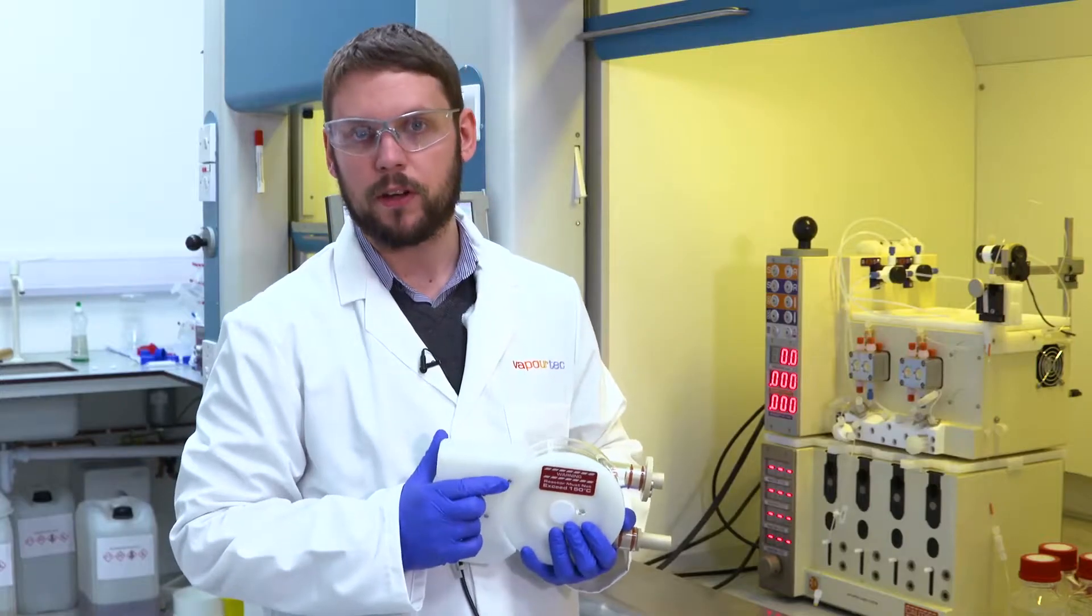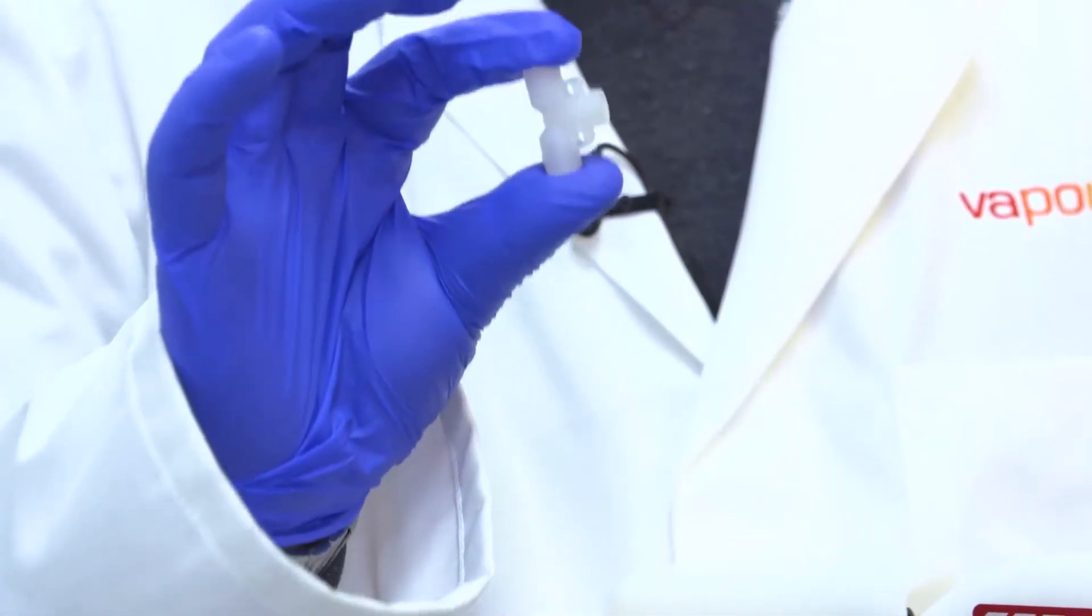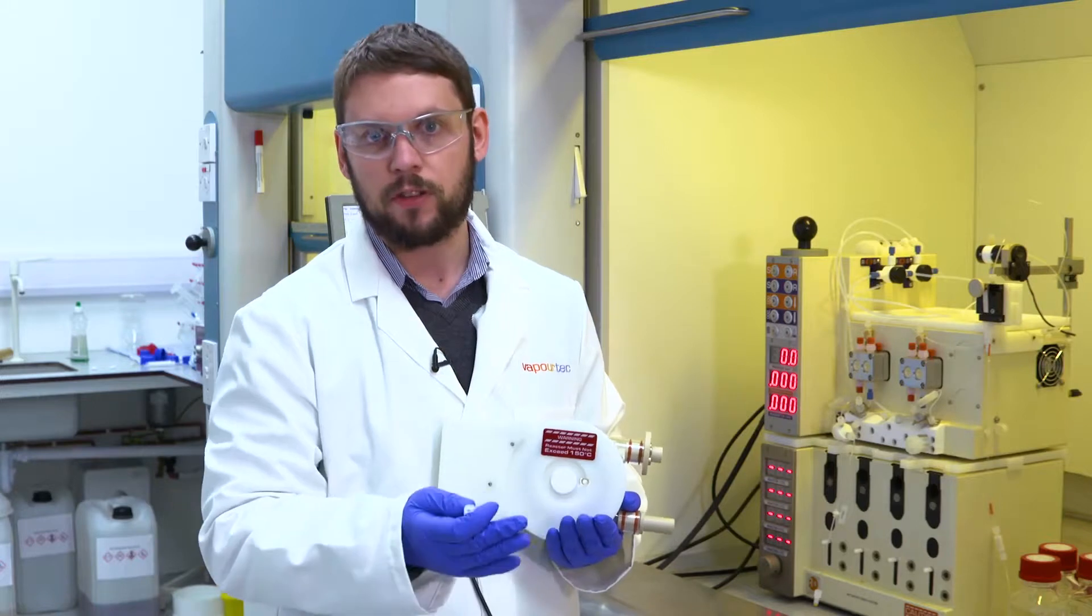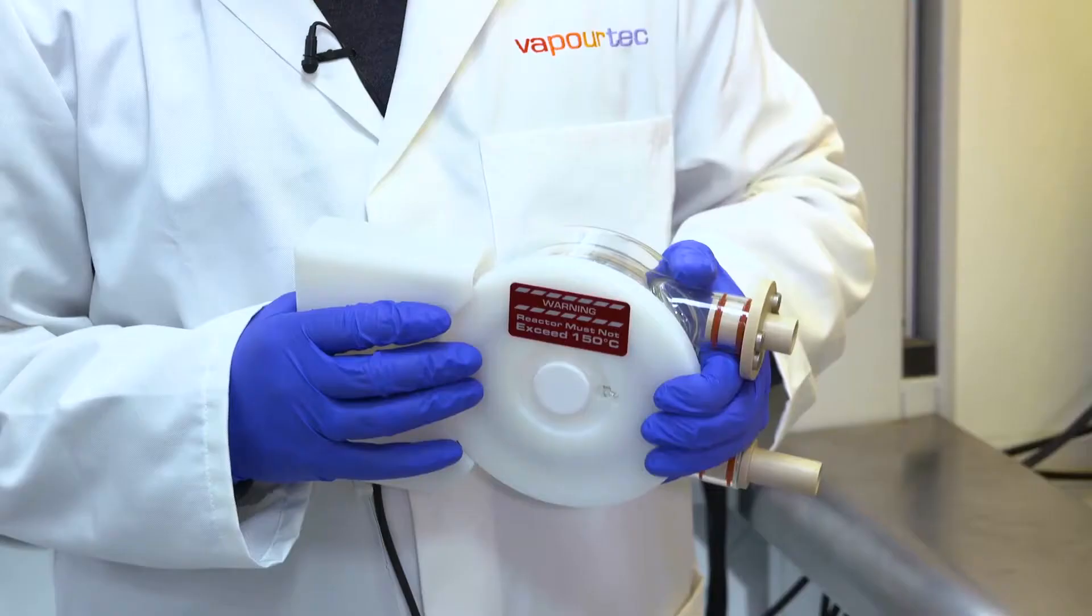These reactors are ideal for biphasic reactions because when you use a tee piece like this you get very aggressive mixing in the mixer, but then as soon as you go into a standard tube the two phases separate and you have the same mass transfer limitations.